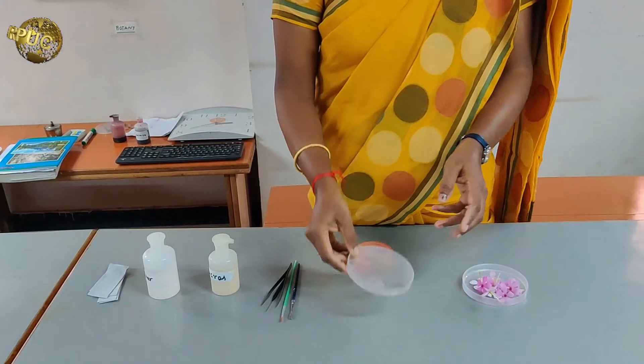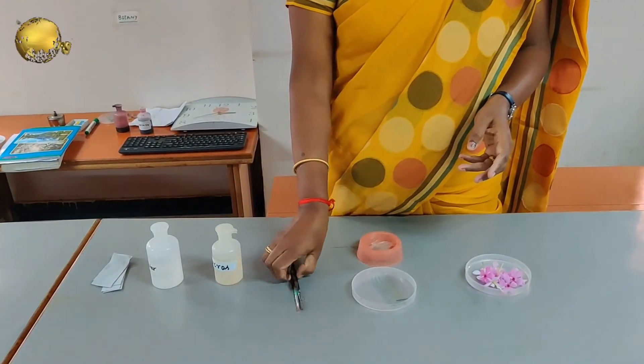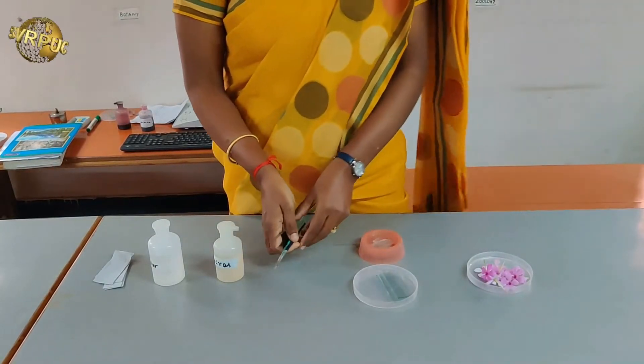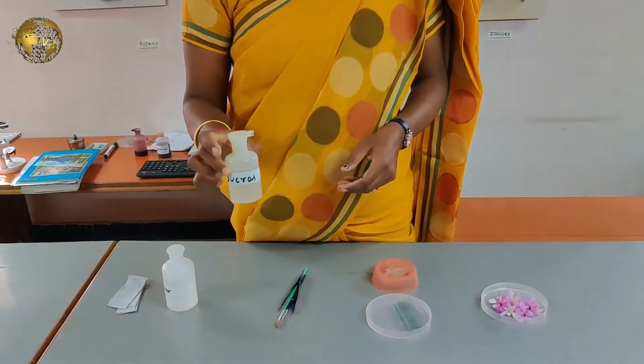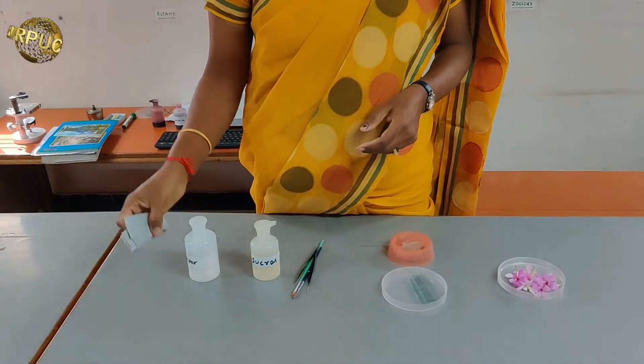The materials required for this experiment are: Vinca rosea, cavity slide, cover slip, instruments, 10% sucrose solution, water, and blotting paper.